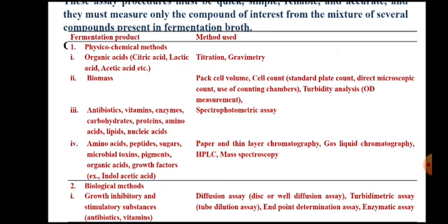Third category of products, that is antibiotics, vitamins, enzymes, carbohydrates, proteins, amino acids, lipids, and nucleic acids. Generally, these compounds are measured with the help of spectrophotometric assay.